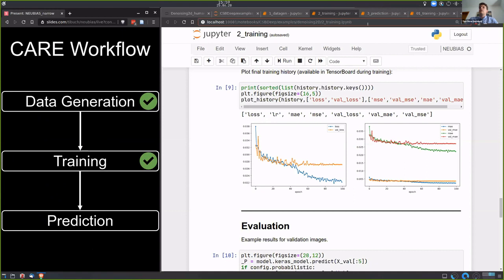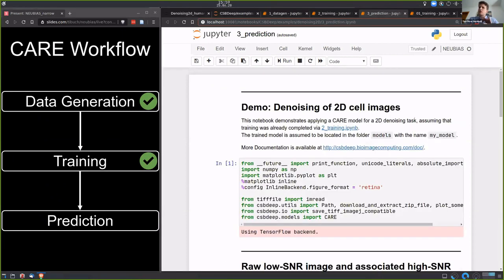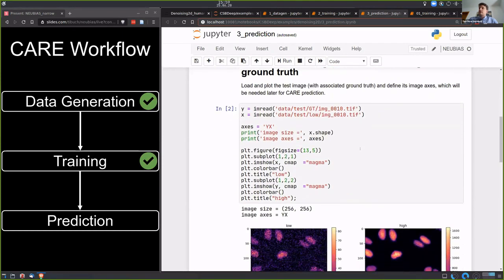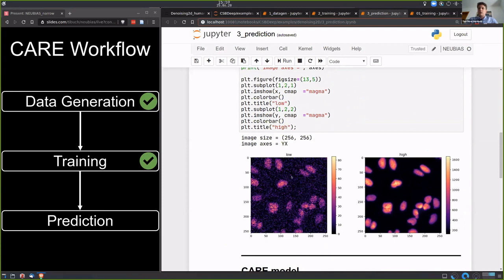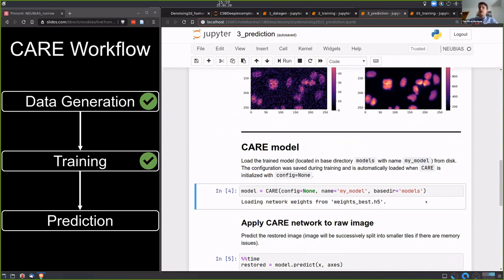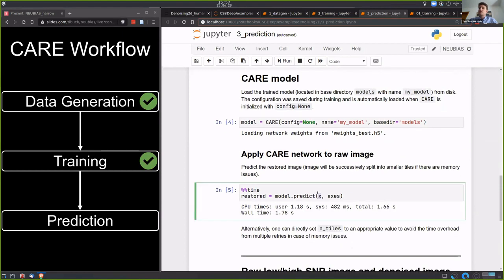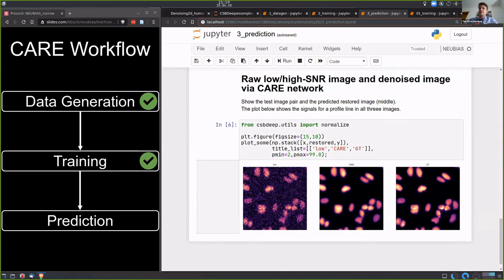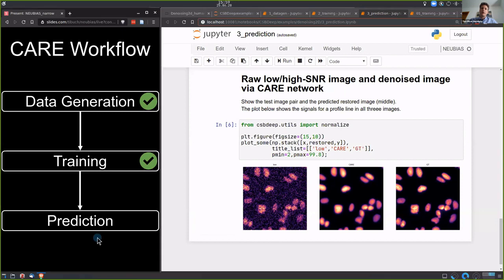The last part is the prediction notebook, which is short. We do some imports, load a new noisy image we want to denoise, and also have the ground truth for comparison. We load our model — which by default loads the best weights — and call 'model.predict' on our noisy image X to get the restored image. The notebook ends with a comparison of the low-quality input, the CARE restoration, and the ground truth.